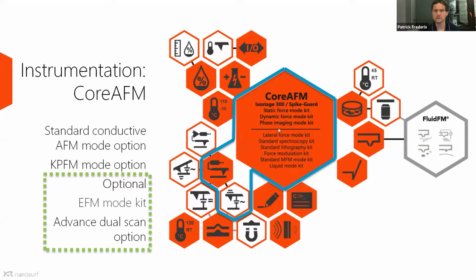That's all standard available in the CoreAFM. In addition, I have the standard conductive AFM mode so that I can work with conductive cantilevers. And I have the KPFM mode option that makes this mode available in the software.